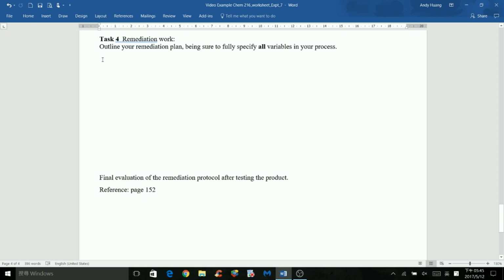So obviously there were 3 different types of ions. Number 1, fluoride. Number 2, iron 2 plus / iron 3 plus. Number 3, water hardness. You can either express it in calcium 2 plus / magnesium 2 plus or calcium carbonate. However you want to express it. We can just simply say water hardness.